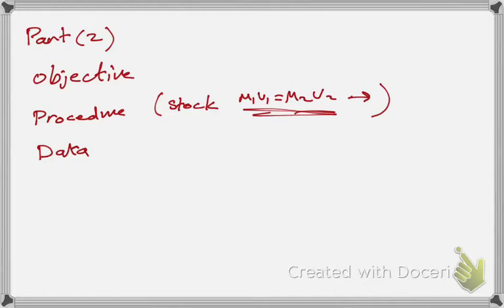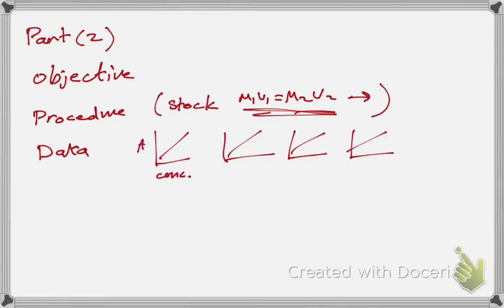And in the data, remember, you're going to have 4 diagrams. And I want to see all of them nicely done with a trend line and an equation with Excel. Remember, this is absorbance versus concentration. Every diagram has to have a number, and it does have to have a title, okay?